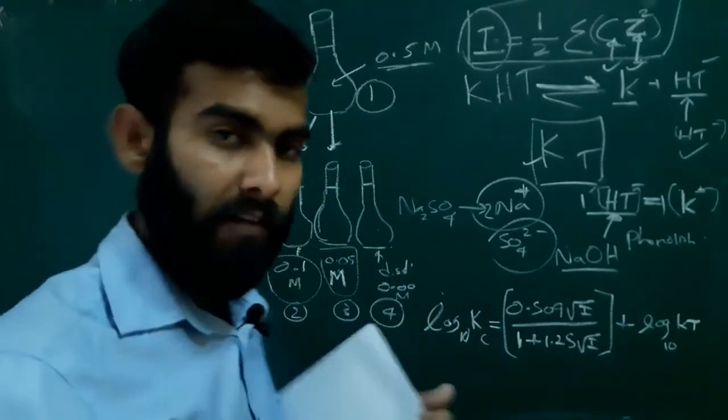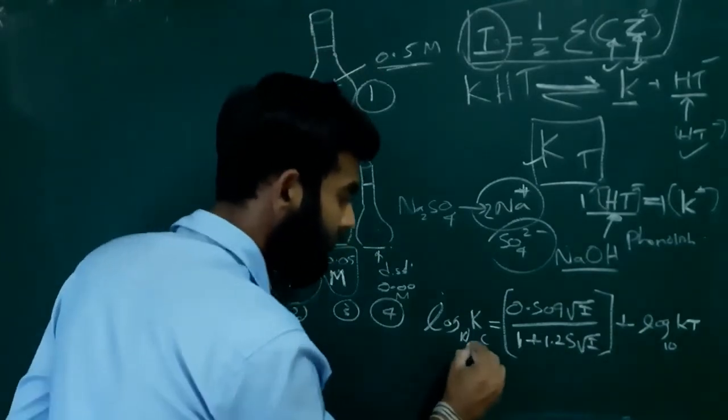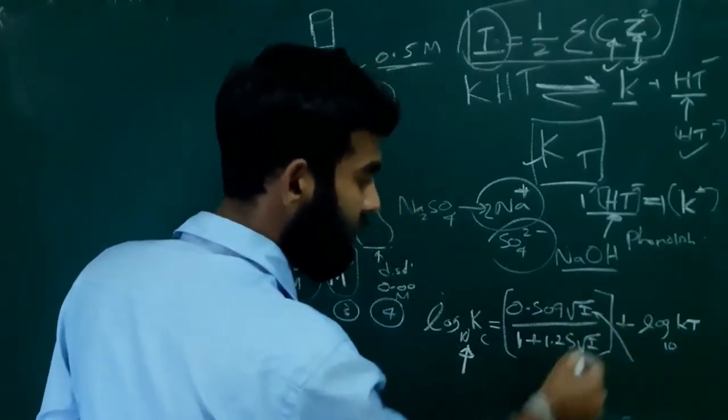So after doing this experiment, the aim is to calculate this Kc, and we will know these ionic strengths. All the other values we know.